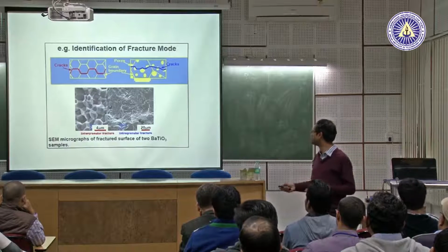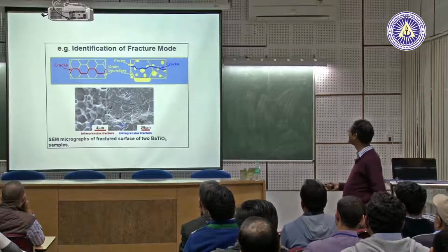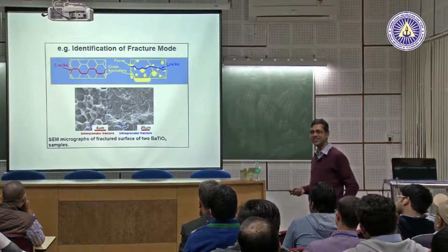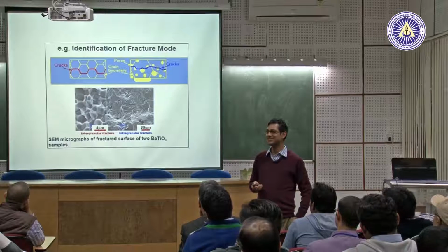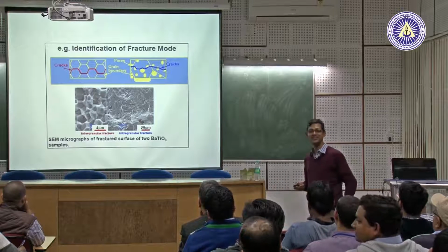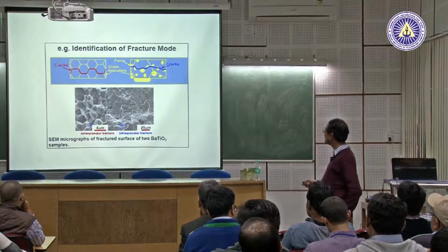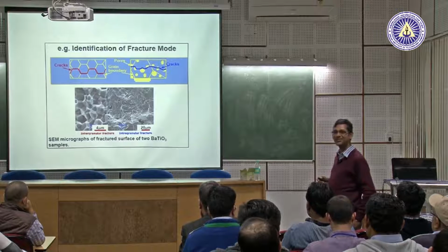This is the simplest thing you do. Okay, tell me one thing. Oh, it's written there. These are the mistakes I have done, right? What kind of fracture is this? The crack is passing along the grain boundaries. So grain boundaries are weaker than the grains, right? One example where you can see this, where the grain boundaries are weaker than the grains: sensitized stainless steel. Yes, a very, very classic example. Stainless steels will have this chromium, right? It creates a problem, chromium carbides. So by looking at this morphology, you can clearly say that. You don't have to ask anybody else.